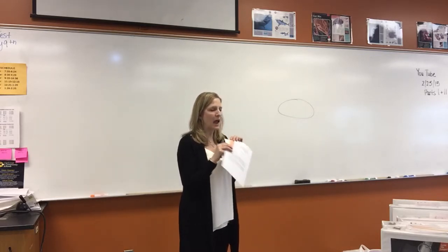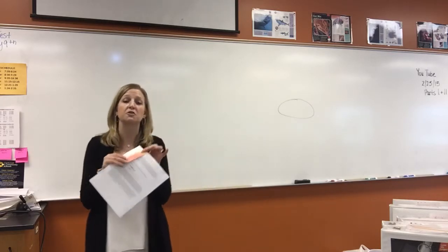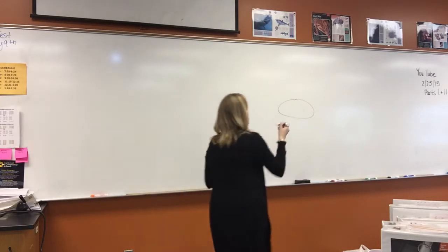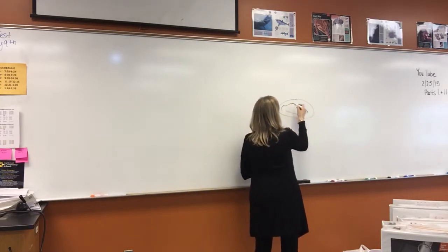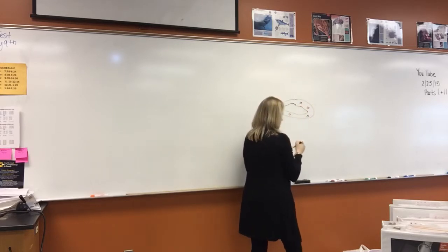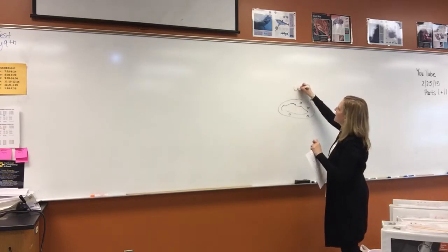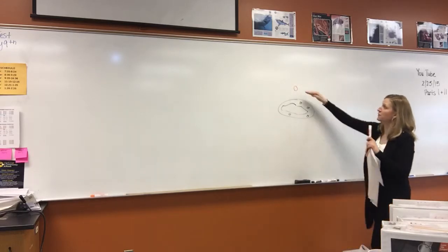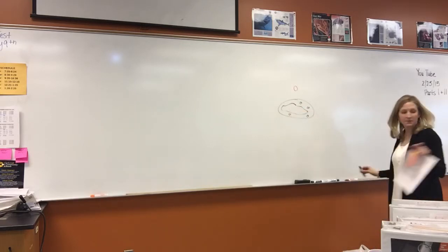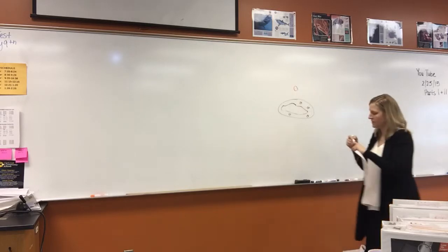And so after you make the recombinant plasmid, the second thing you have to do is to try and get that plasmid into the bacteria. Remember that bacteria has the big circular chromosome, and it has plasmids. Plasmids are found inside there. Then what you have to do is take your recombinant plasmid. So this is foreign DNA to this particular bacteria. The recombinant plasmid in this activity had the human growth hormone gene in it.